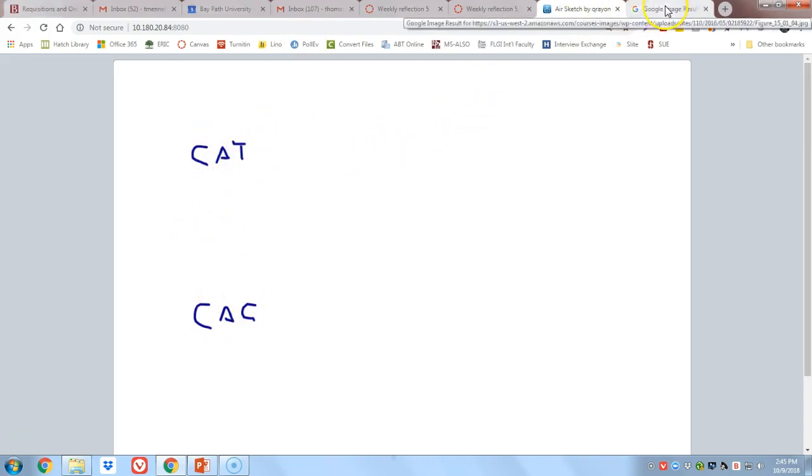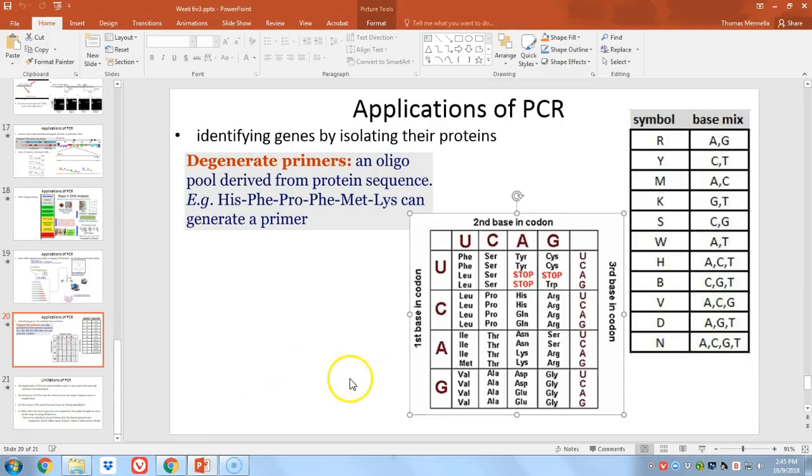And then we go back to our sequence, and we see that the next amino acid is phenylalanine. Well, phenylalanine can be encoded by, and I'm going to stop saying U's because we're talking about the DNA context, so it can be encoded by TTT or TTC. Those are the only 2 codons that encode phenylalanine. And I'll say them again. It's TTT or TTC.